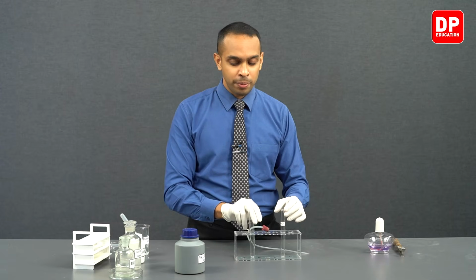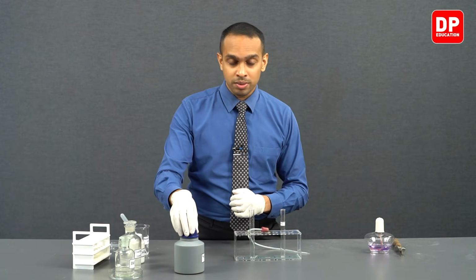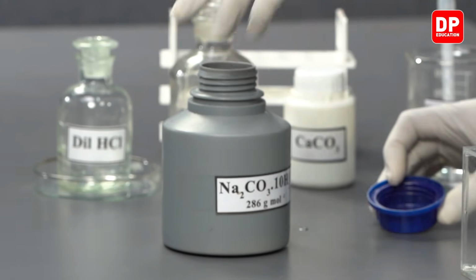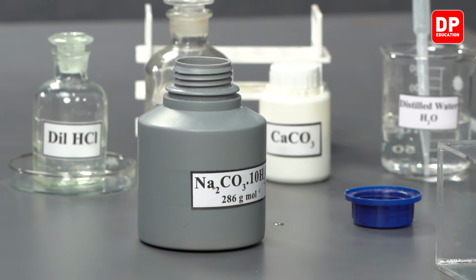So let's take a small sample of our sodium carbonate here into our test tube, and then add a little bit of hydrochloric acid and observe the formation of carbon dioxide.